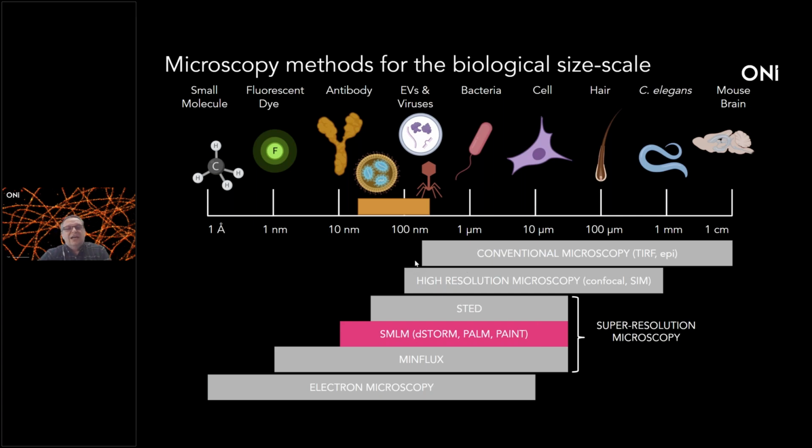So if you look at this diagram, I am highlighting here different microscopy techniques. And these are the conventional microscopy techniques, which are limited by the diffraction limit. These microscopy techniques include TIRF microscopy, which is total internal reflection fluorescence microscopy, or epifluorescence, or confocal microscopy. So these are the much more common microscopy techniques. But if you realize, these techniques are not able to visualize individual lipid nanoparticles because their size is smaller, and the limit of these technologies is the diffraction limit of the microscope.